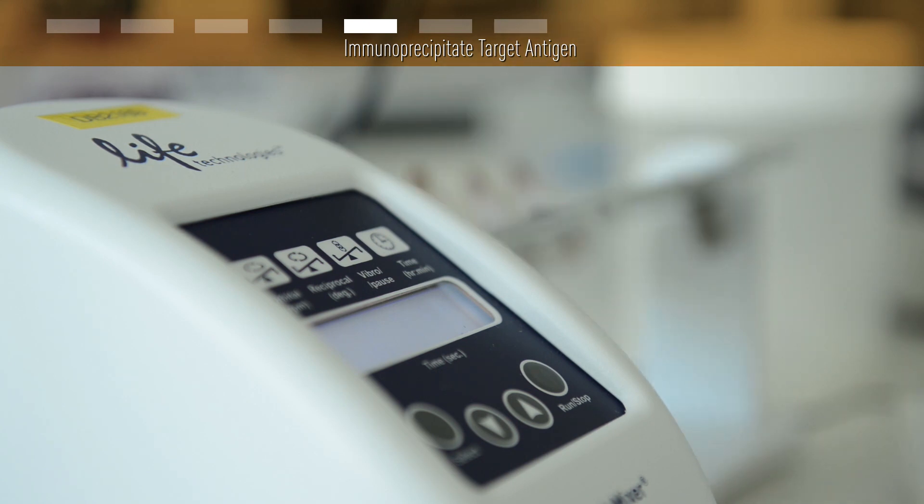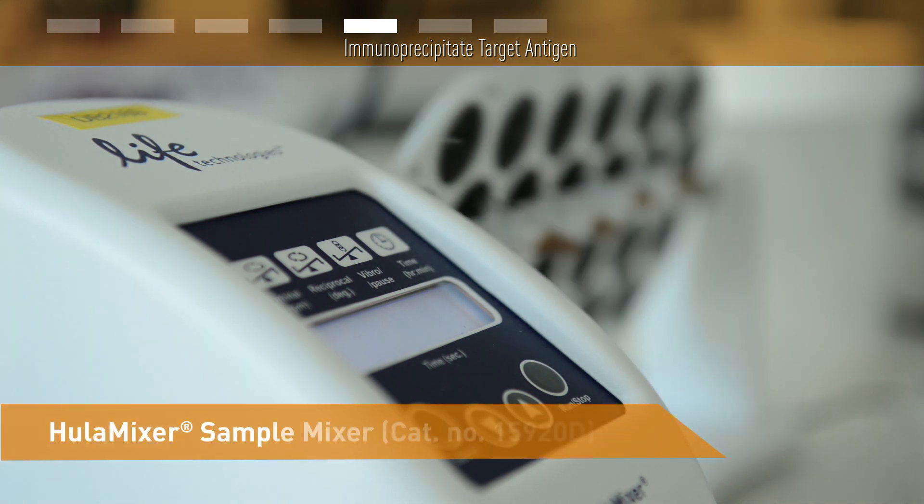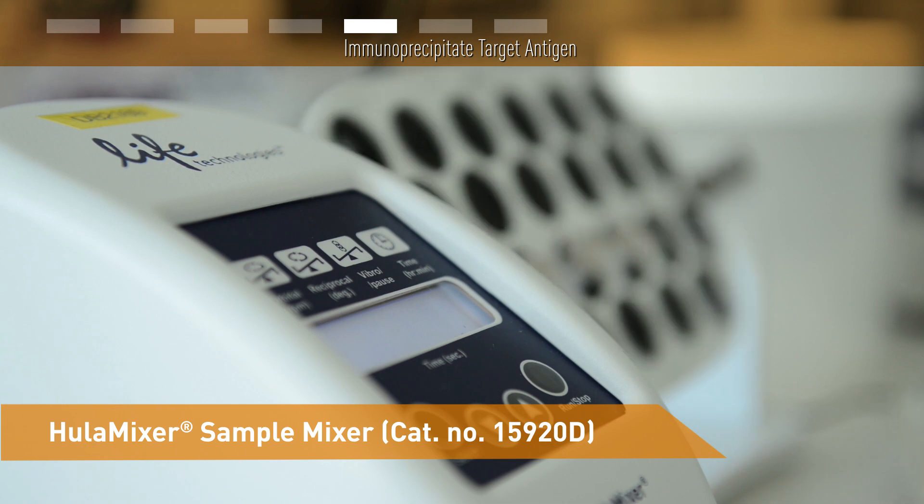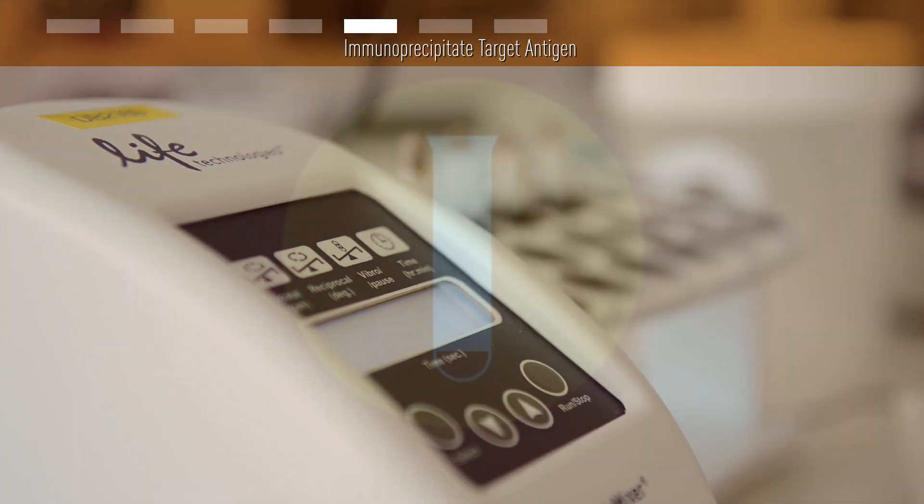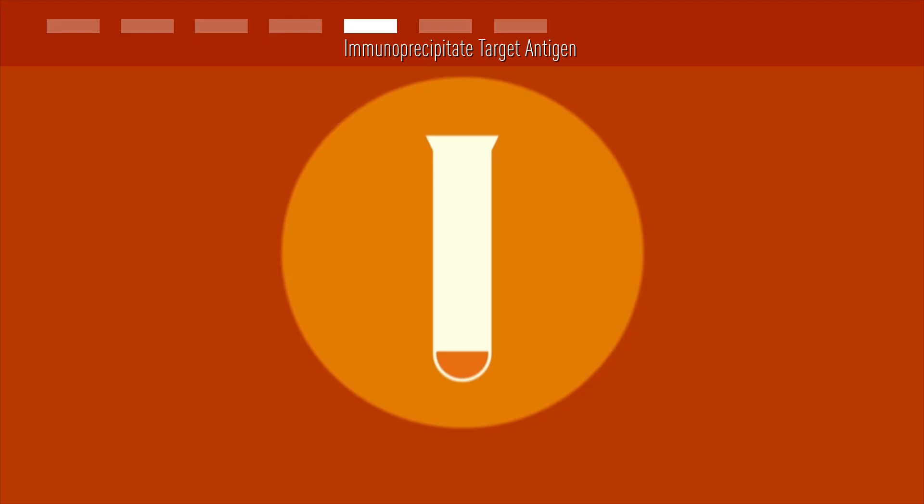Good mixing is important, and we recommend using a sample mixer that allows for tilting and rotation, such as the Hula mixer. An alternative approach for low affinity antibodies or difficult targets is to incubate antibody and sample before you add the beads. This could improve the binding kinetics and keep nonspecific binding at a minimum.